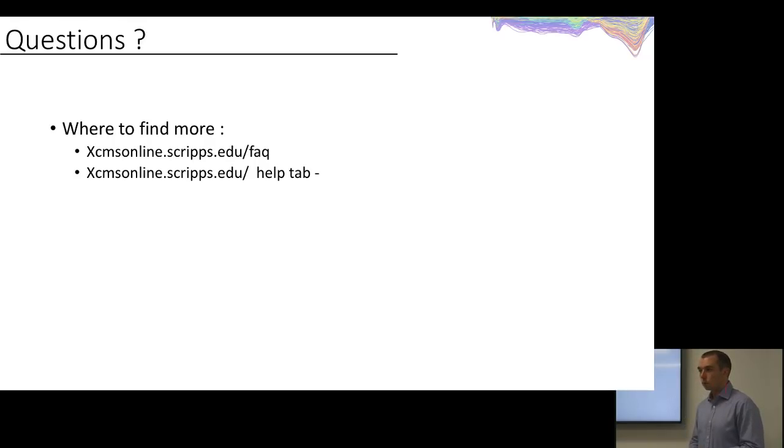You have a few more questions coming in. Okay, sure. Which sample was set up as control sample in the cloud plot as default, so one can know conclusions about up and down regulation? So how do you assign which one first? I believe it says on the screen as you're setting it up, but the first sample, I believe, is the control, and the second sample is your experimental.